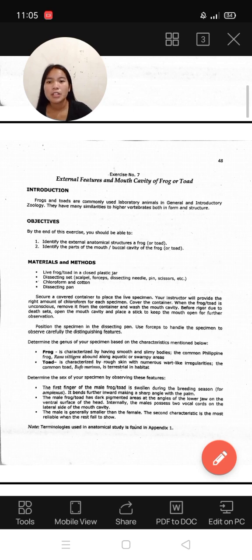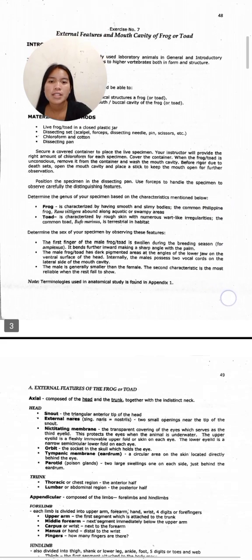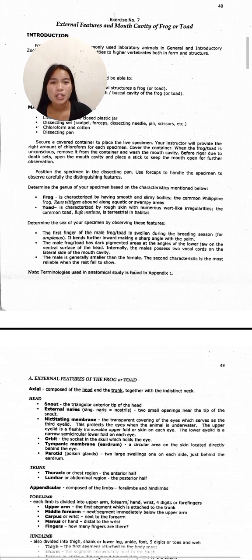Secure a covered container to place the live specimen. So, internal vertebrate or external features and mouth cavity of frog or toad.